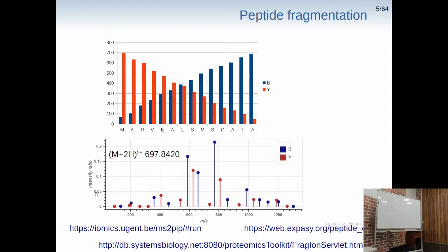the intensities of those fragments, or the number of those fragments, the count of those fragments if you will, is different. Why do you think not all ions are present in the same amount in this fragmentation spectrum? Because some parts of amino acids are the same? No. No? Some of them, as you can see, have almost zero intensity in the real data. From the data, if we did it in silico, we'd get just the same level.